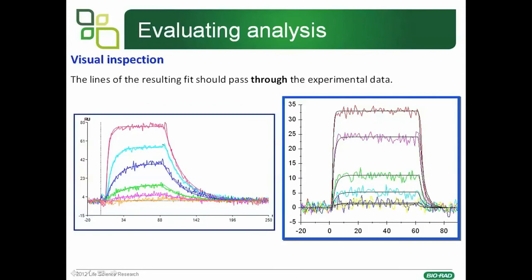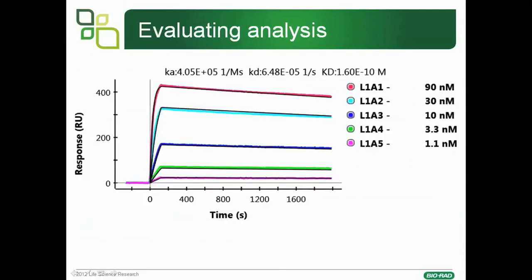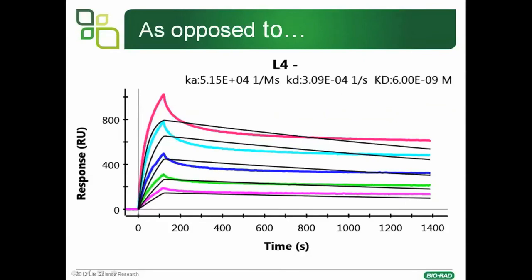Having done all that, the next thing to do is a visual inspection. Do your fit lines pass through the experimental data — in other words, do they pass through the middle of any noise? On the left-hand side, when you've got relatively slow dissociation, and on the right-hand side when you have faster on and faster off, the fit lines should still pass through the middle of the data. In our continued example, you can see that the fit lines pass broadly through the middle of the data with no systematic deviations. As opposed to this example here, where clearly the fit lines do not pass through the middle of the data sets — this would be described as a poor fit visually.